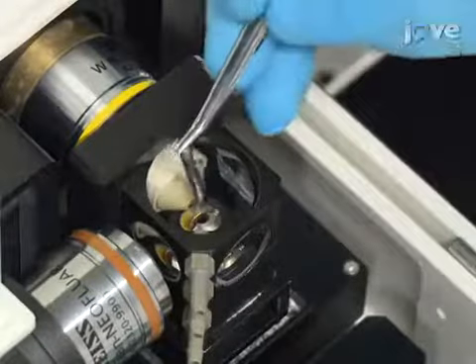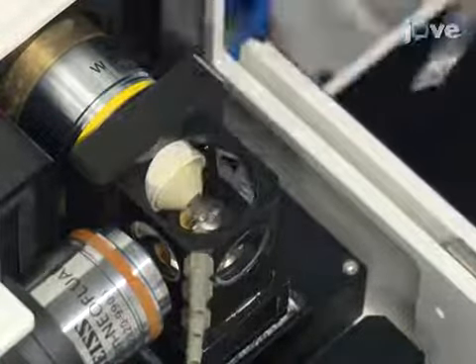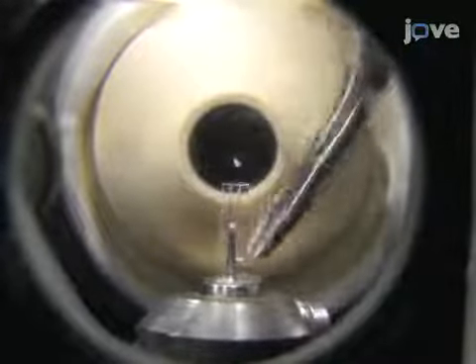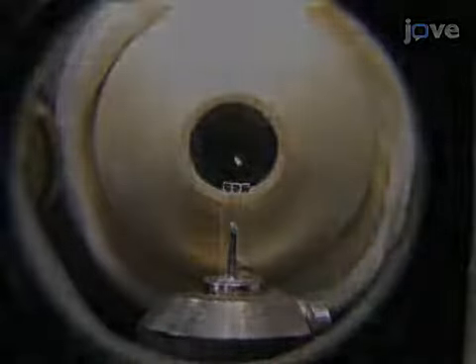Then insert the steel cylinder with the pin into the sample chamber and stick the capillary fragment on top of the pin. The agarose column should protrude a few millimeters from the region of the capillary fragment that contains the embryo.